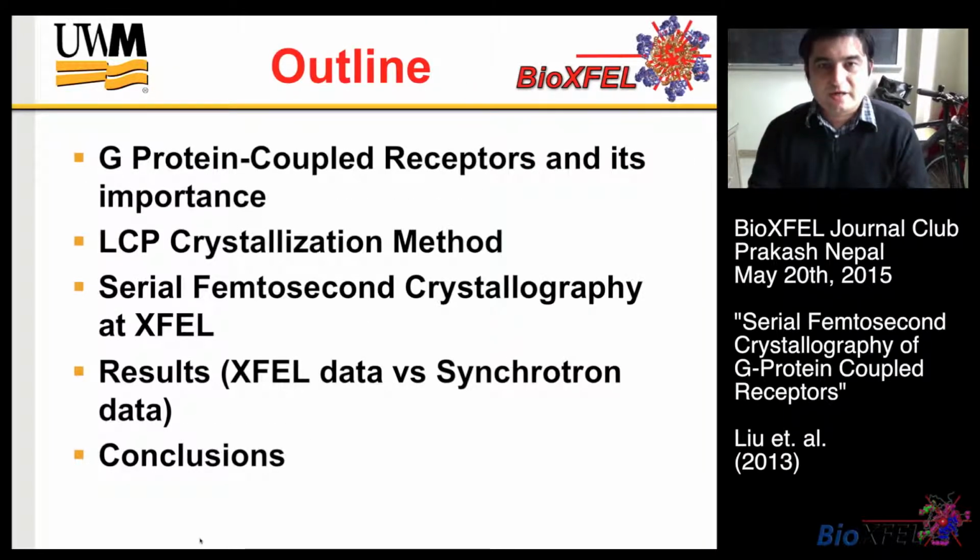The outline of my talk will be: I have some slides on G protein coupled receptors and their importance, and then some slides on the LCP crystallization method. Then I will talk about serial femtosecond crystallography at XFEL, and in this paper the authors are mainly comparing the results from XFEL versus synchrotron data. I will then show the results and conclusions.